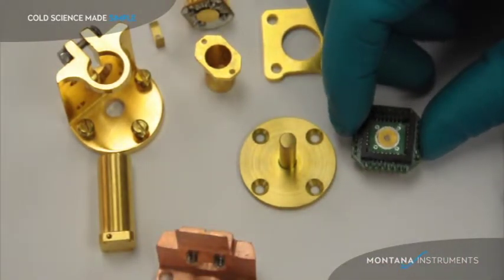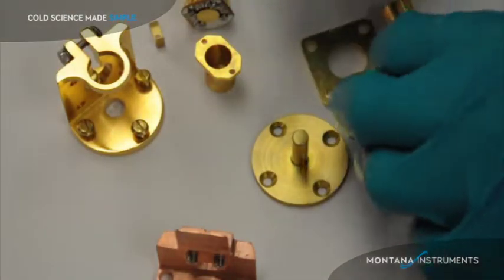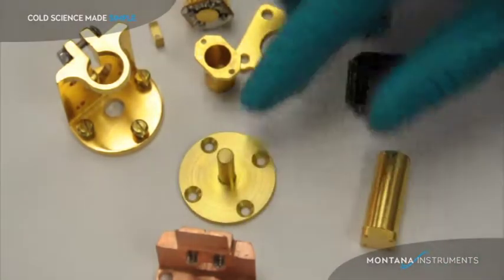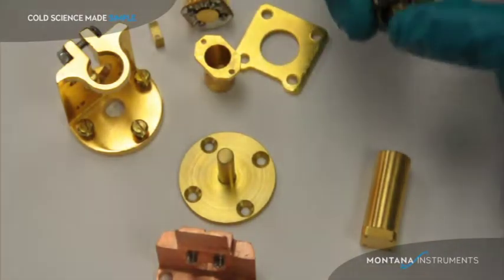Here we have the CB12 and LCC28 thermally damped electrical sample mounts. These mount on the end of the post. You can see the four screws there that mount down, and give you a strong thermal connection of your sample to the post with electrical connections made very easy.